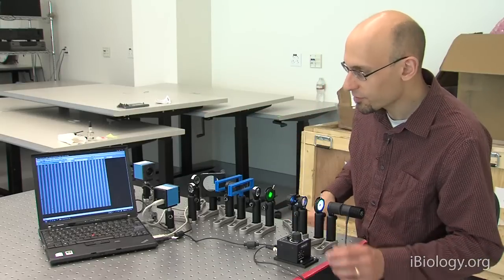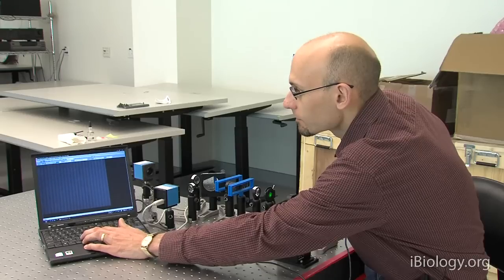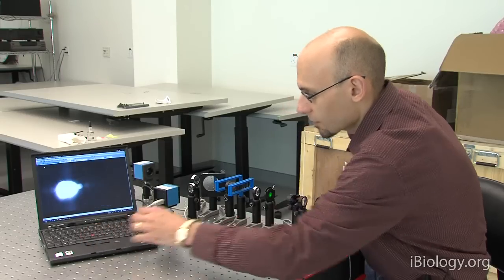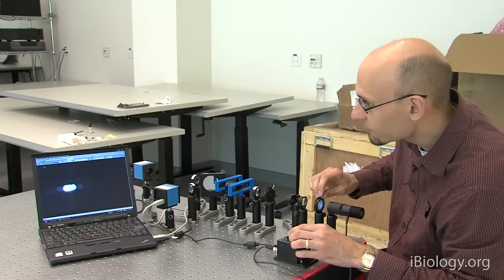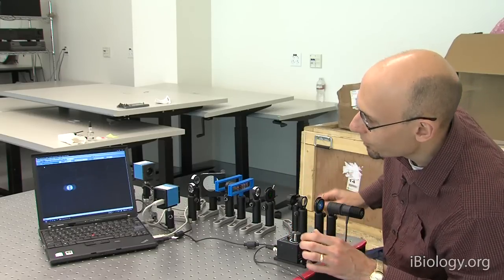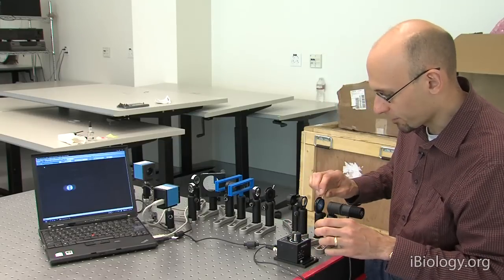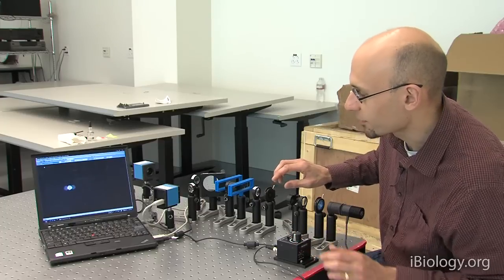If we now switch cameras and look at the back focal plane, and we turn this down, and then I need to close this. What you can see now is that this gives rise to a set of diffraction patterns. So let's just adjust the brightness. Let me close that down as much as I can.